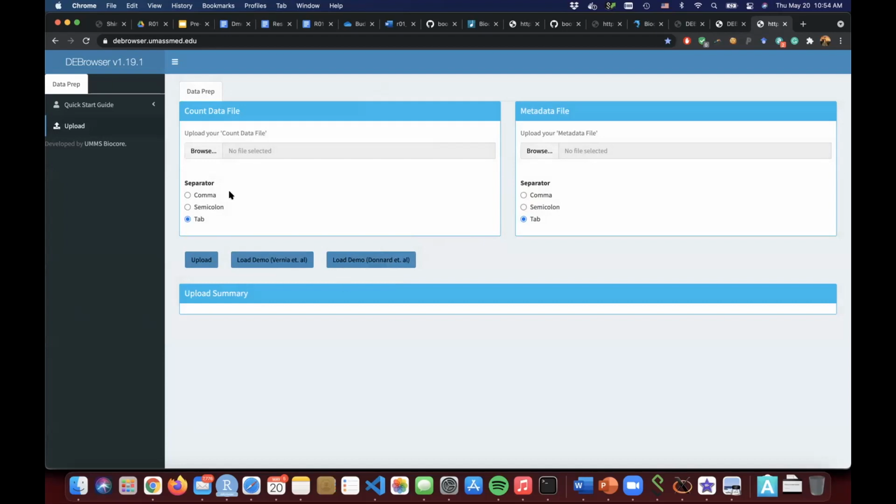Basically, you cannot save it here. It's like a browser. You have to load it and then do your things, and you cannot save them here. But it's easy to do things. That's why we had this save option before, but I had to remove it because of a couple of problems in the new versions. In the future, I'll add this save functionality again.